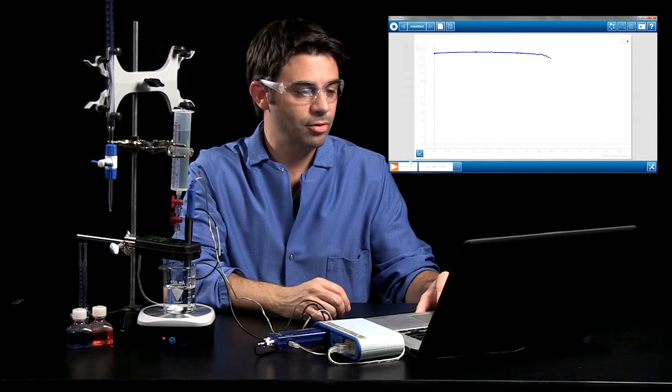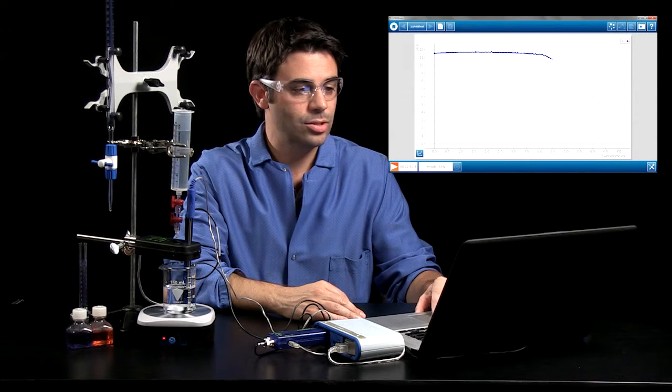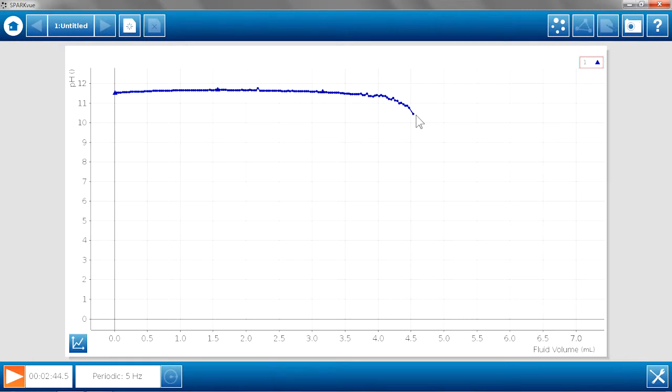So we can see after a couple of minutes of data collection, the pH is starting to gradually go down. And now it's going down steeper. And now we see those big drops in pH that are indicative of the equivalence point being reached. And we'll let this go for a little bit longer to round out that pH curve.